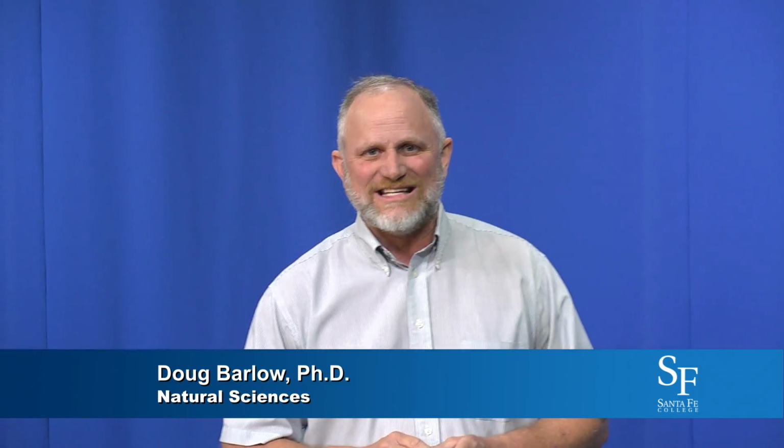Hello, students. I'm holding a thermal detonator. No, actually, it's just a simple device called a calorimeter, and I'm going to show you how to use it today in the pre-lab video for heat capacity.